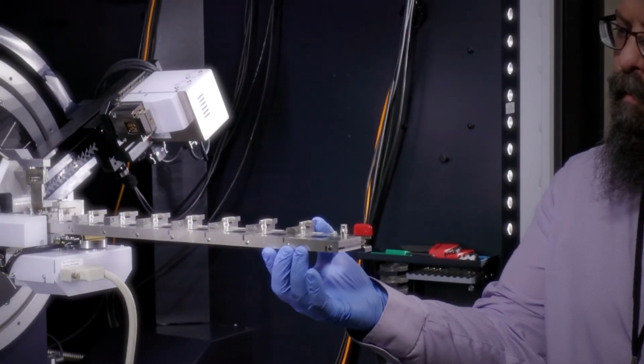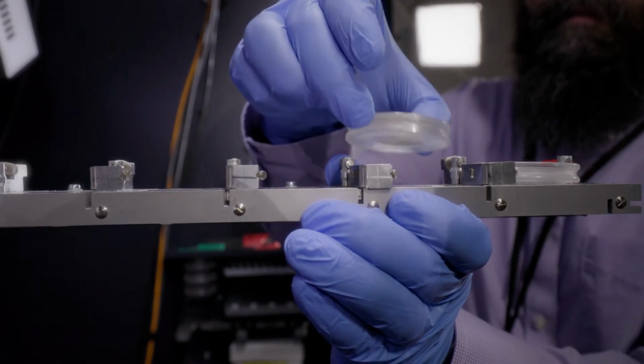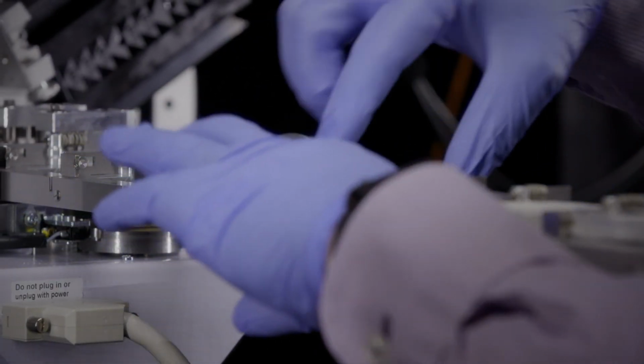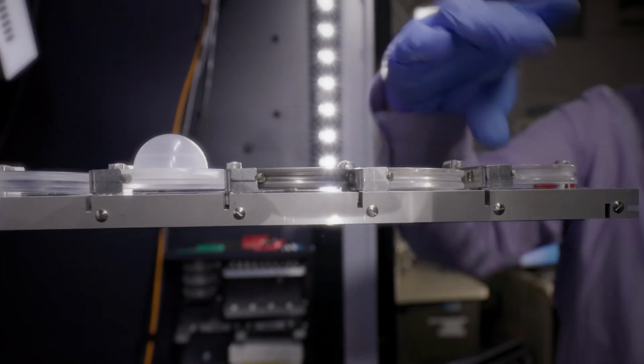Insert the sample holder by depressing the spring for that position. Make sure the sample holder is not sticking out past the edge of the sample tray, as this will cause a collision when attempting to load a sample.